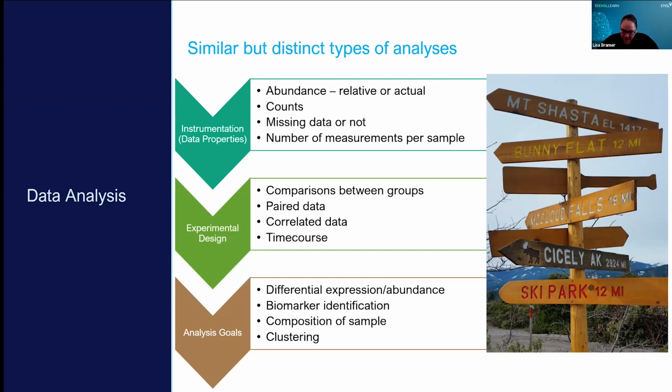So part of the concept here is EMSL in particular is generating very similar types of data. So you may run your data and get metabolomics and proteomics. And these data types are very similar from the spreadsheet type of view where you have biomolecules and samples and you get some sort of information about those.